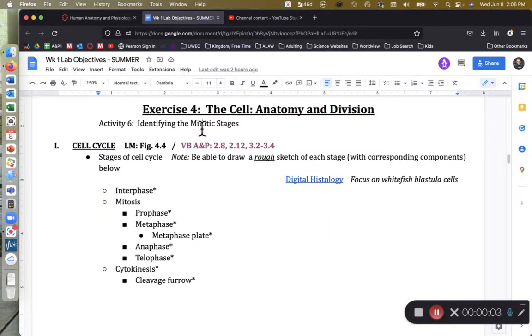Hey class, in this video we're going to focus on cell division. We're going to focus on stages of the cell cycle, and I want to really emphasize here, we're going to be kind of sticklers, kind of pedantic about mitosis versus cytokinesis. As we think of mitosis, I want you to fixate on division of the nucleus. Cytokinesis is division of the cytoplasm.